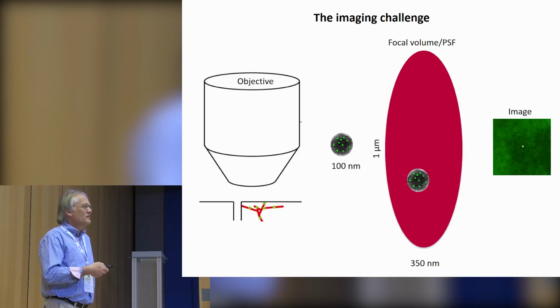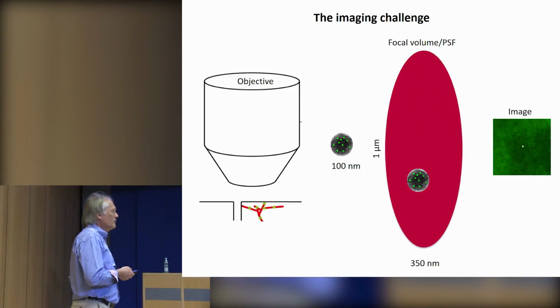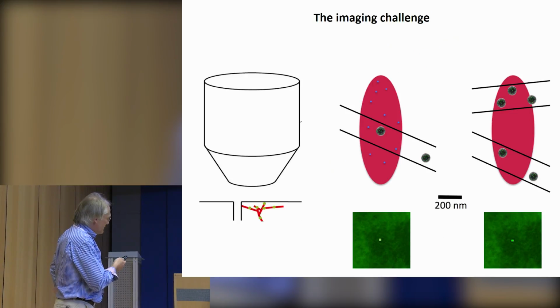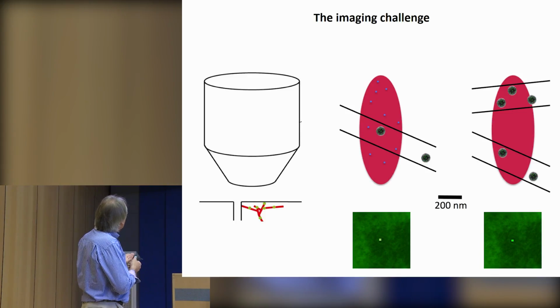So this might be one way how one could potentially discriminate how many vesicles are in that volume, but we tried to do some sort of quantal analysis. It didn't work, so there are too many factors that influence the intensities of those signals. So now if you imagine there is an axon running through your focal volume that you're imaging, and you have in blue, this would be autofluorescence, this would be your specific fluorescence. Now, in this situation, you could easily discriminate, obviously, this vesicle from that, and it would give rise to a signal like this, for example.